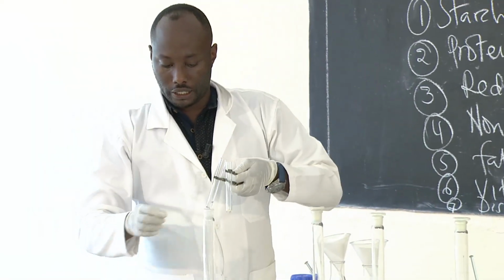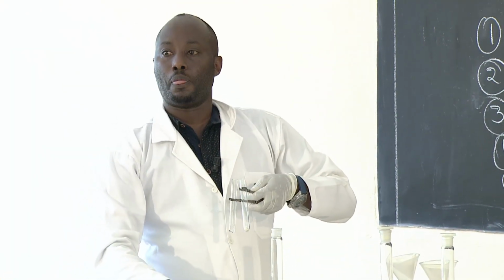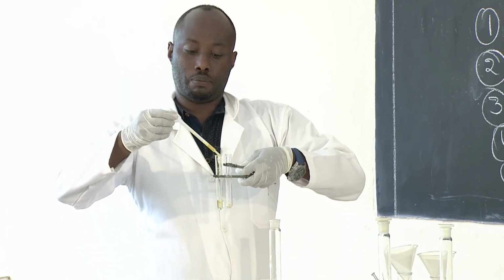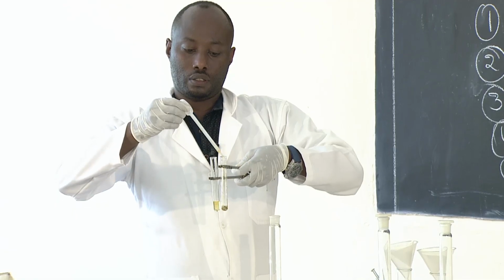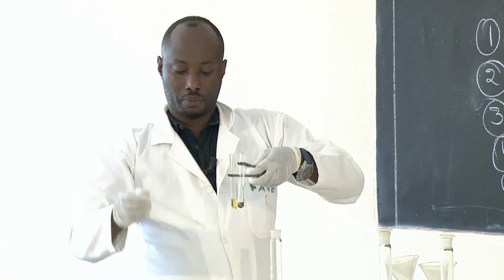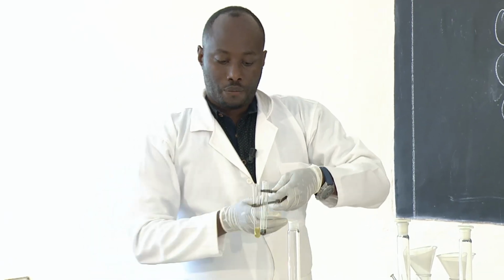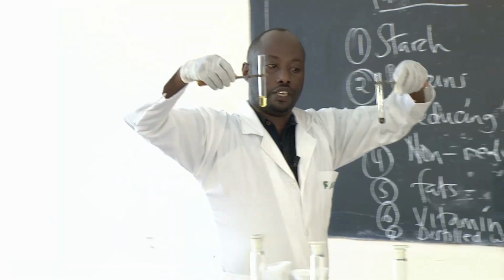I'm going to put the same amount of iodine solution now in the two test tubes. I add the same drops. From here, you can make the observation now.